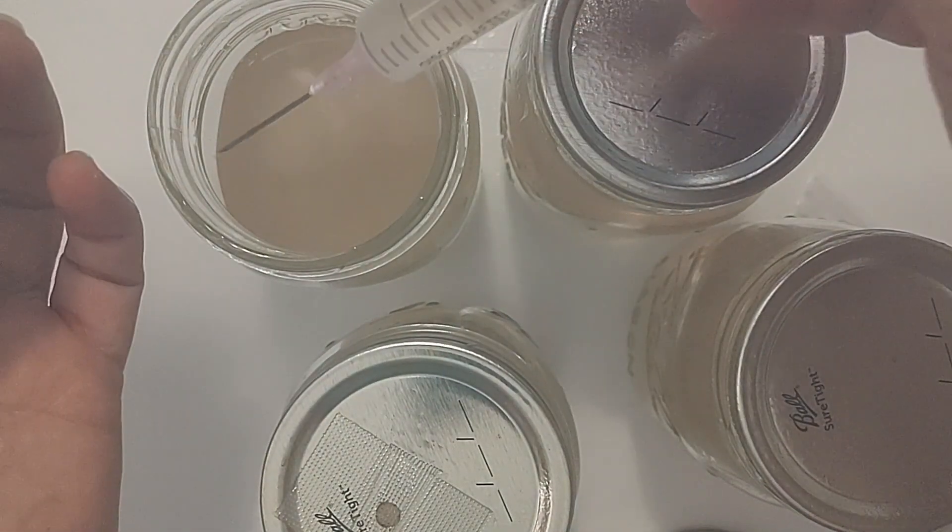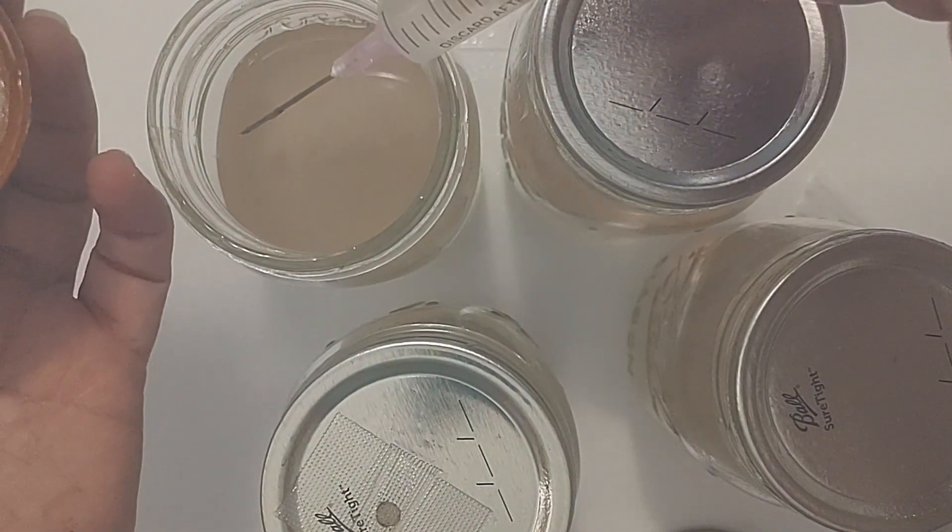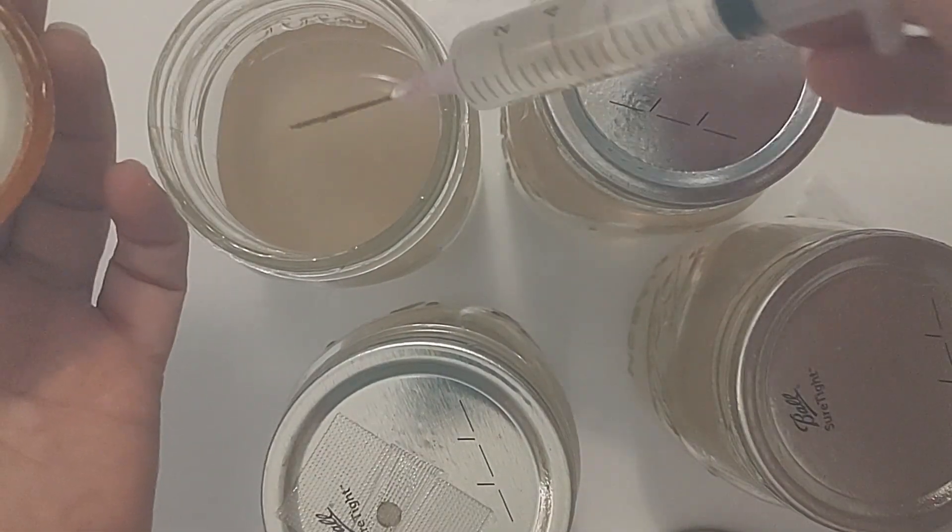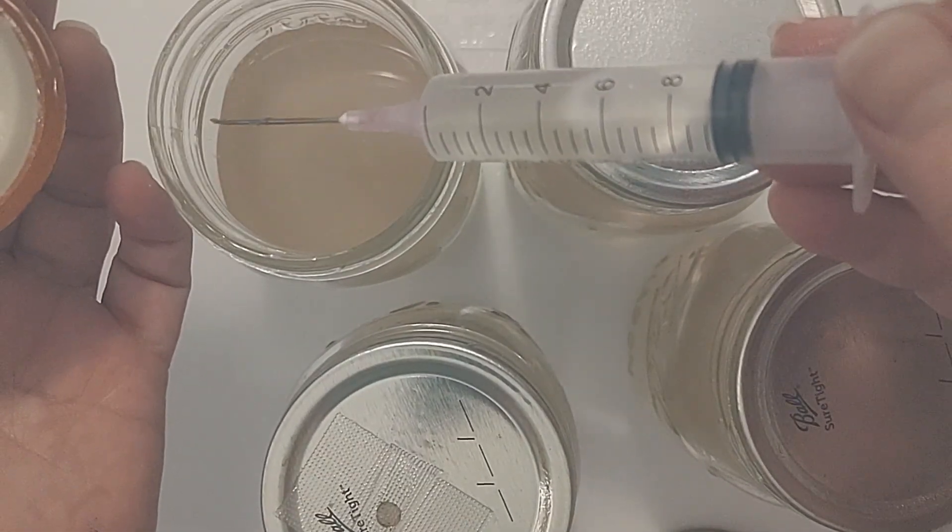I'm just moving the syringe all around to get a full syringe here. A full syringe.